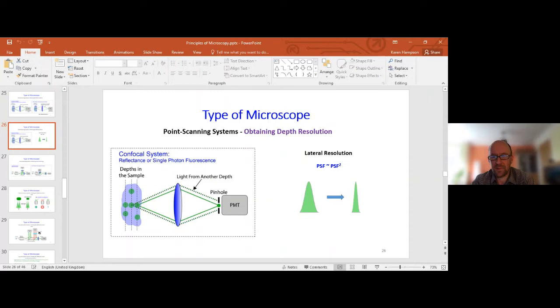Thanks, Martin. What are the techniques we should combine with fluorescence microscopy for live cell imaging?